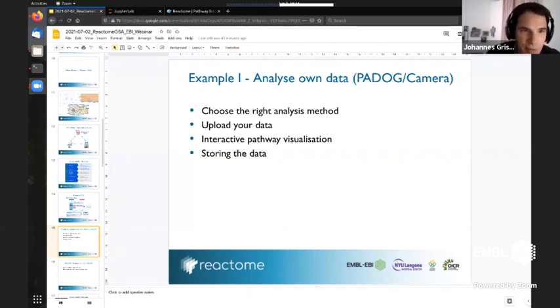Gene set enrichment is performed at the gene level. How do you solve the multiple isoform values for a single gene? Which one do you choose? Good question, and I'm going to use this to answer a different thing as well. So what we do is we use your identifiers, whatever level you annotated it. What we need from you is already gene or protein level data. For proteomics, this means actually doing the whole protein inference. That's something you have to do.